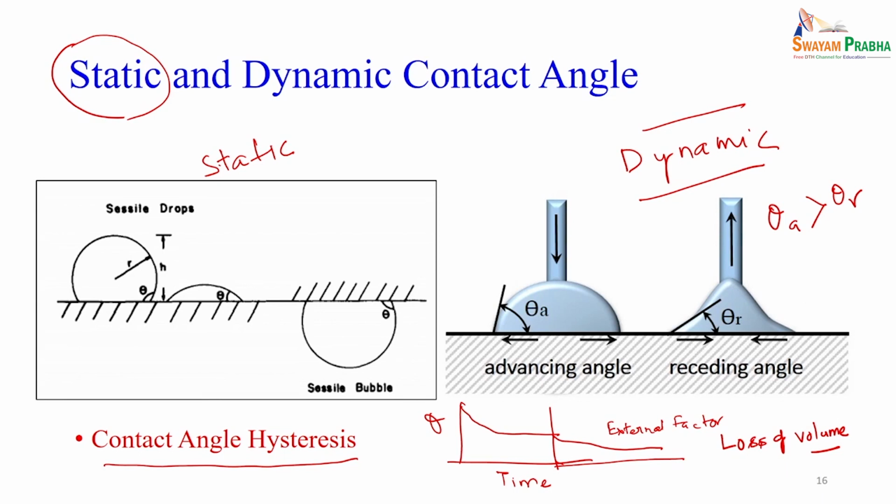So, this dynamic contact angle or contact angle hysteresis is helpful, because it says the drop is in a metastable state, not in equilibrium, which is why the contact angle is changing. At the same time, it also gives information about the physical or chemical heterogeneity of the surface. Physical heterogeneity may be a rough surface, or some air trapped on the surface.